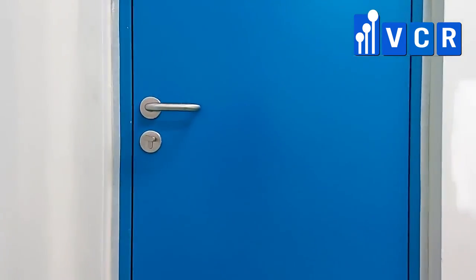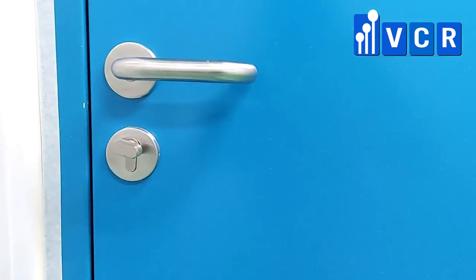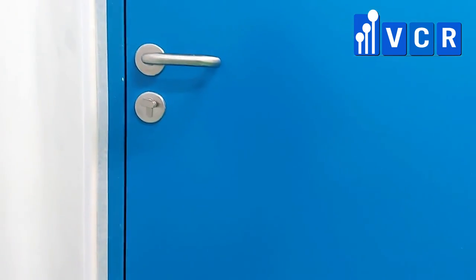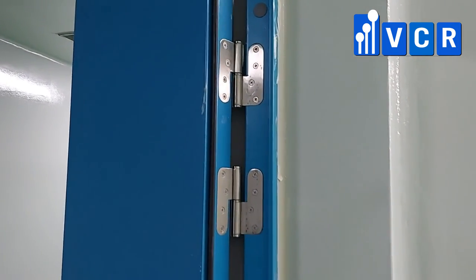The door lock used in this project is a mortise lock with an escutcheon, very easy to clean. The door hinge is made of stainless steel 304.